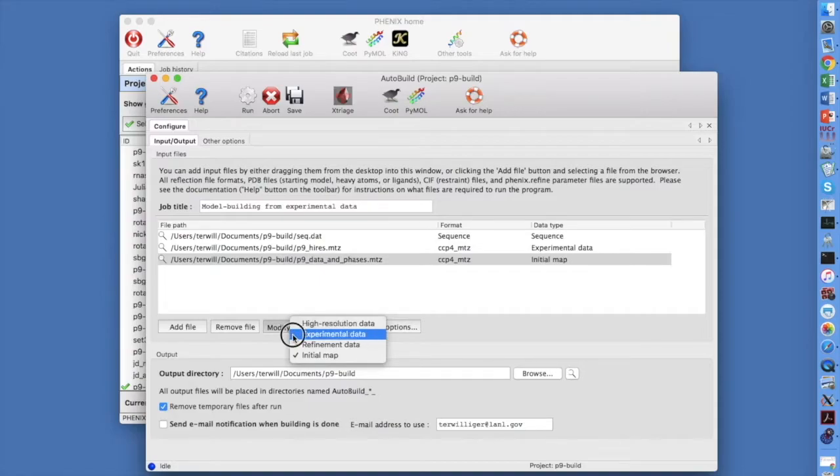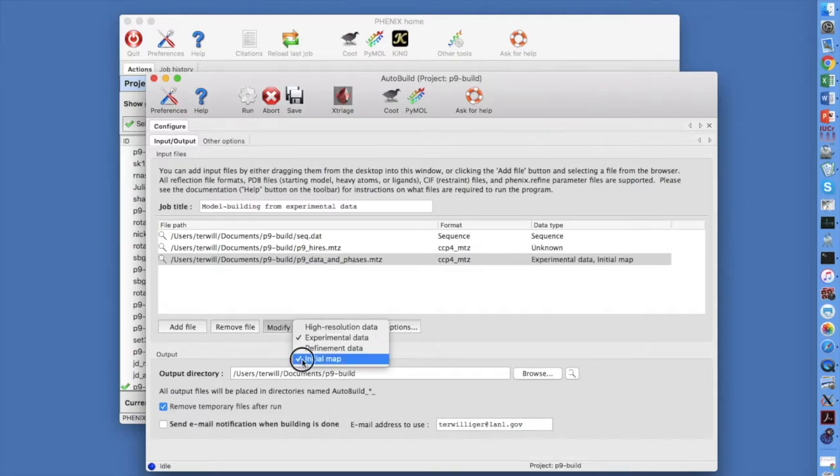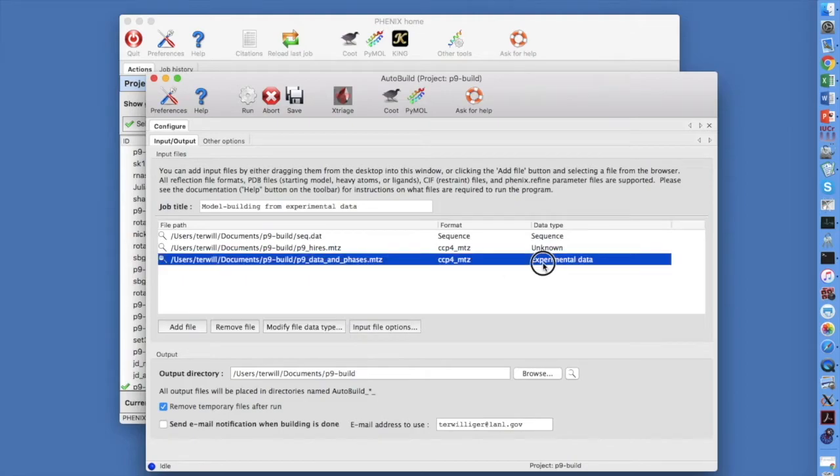Turn on Experimental Data to indicate that experimental phases are present in this file. Turn off Initial Map. Now the GUI knows this file contains experimental phase information.